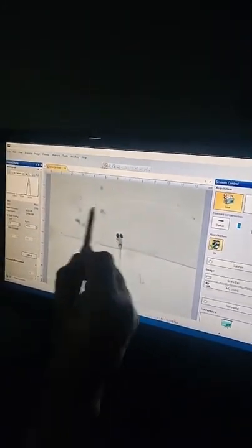This line is the point beyond which everything is restrained and won't move. Everything below that will move. That's the tail, and if I give it any stimulus, it will be able to execute these swims. So now we have a preparation where we can see the fish swimming, as well as record or image the events that are happening in the brain.